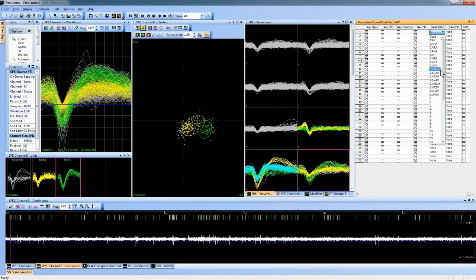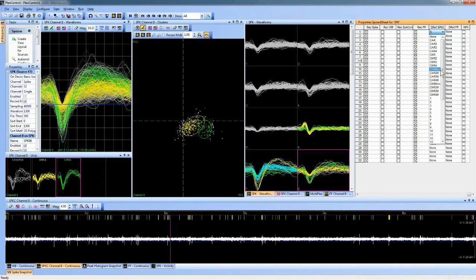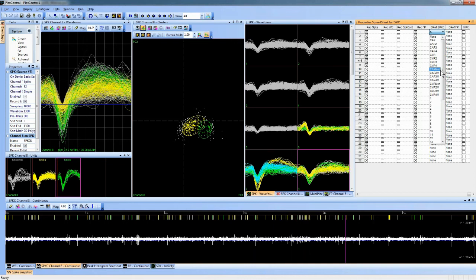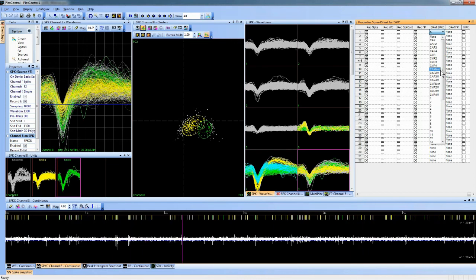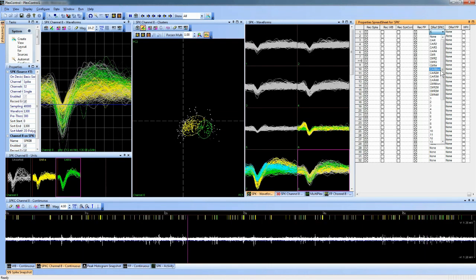So if I selected 10 channels to be CAR1 or CAR, and I had an 11th channel that didn't have any signal that I was interested in, I could set channel 11 to CAR mon. Instead of showing me the data from electrode 11, it would be showing me exactly what that average is.